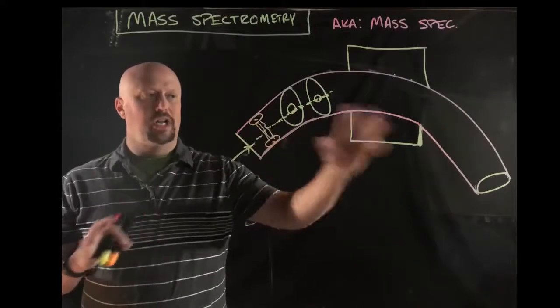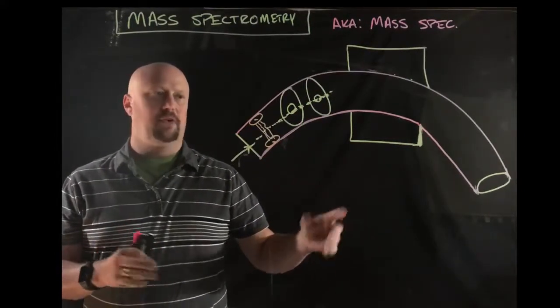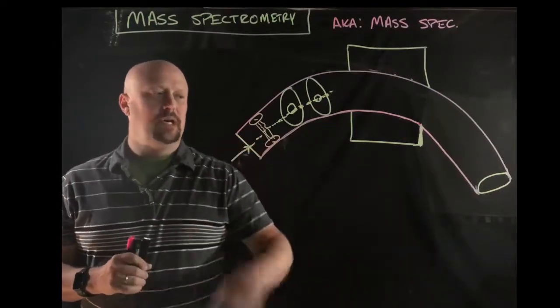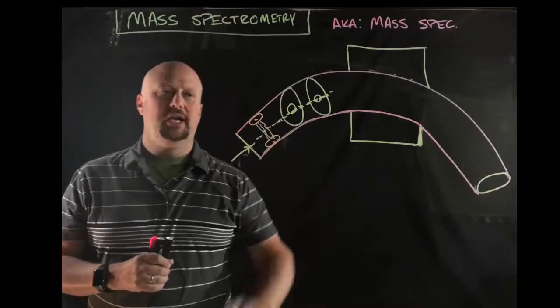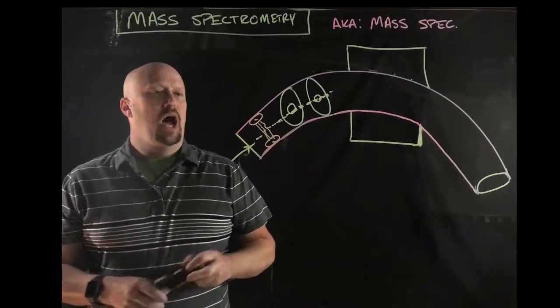Essentially, they're all going to come down to basically the same thing, and there's all kinds of varieties of them. They work in slightly different ways, but essentially it comes down to this. You've got a tube. You've got an input going in one end. We're going to get an output down here, and I'm going to briefly walk you through the parts of how we get to that.